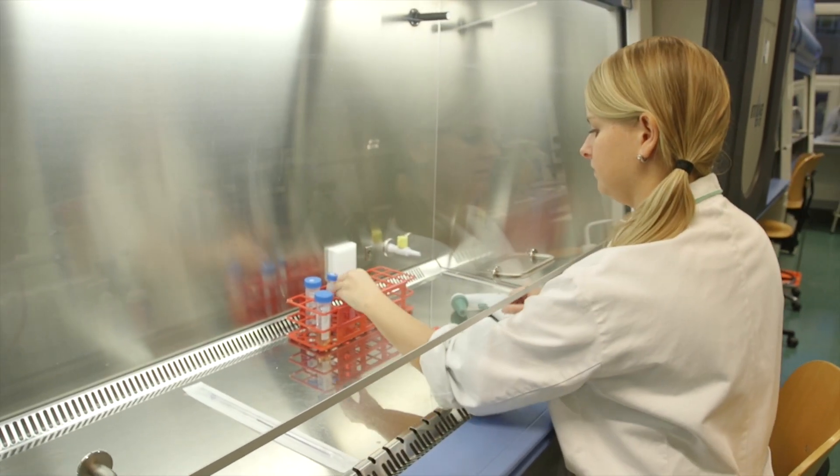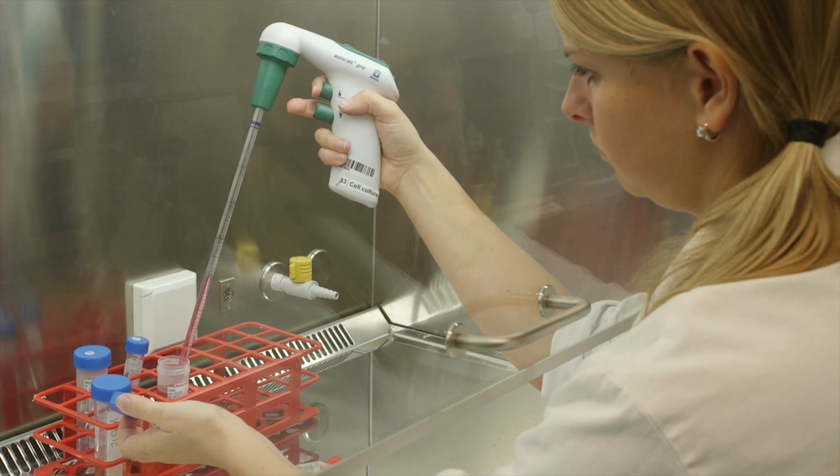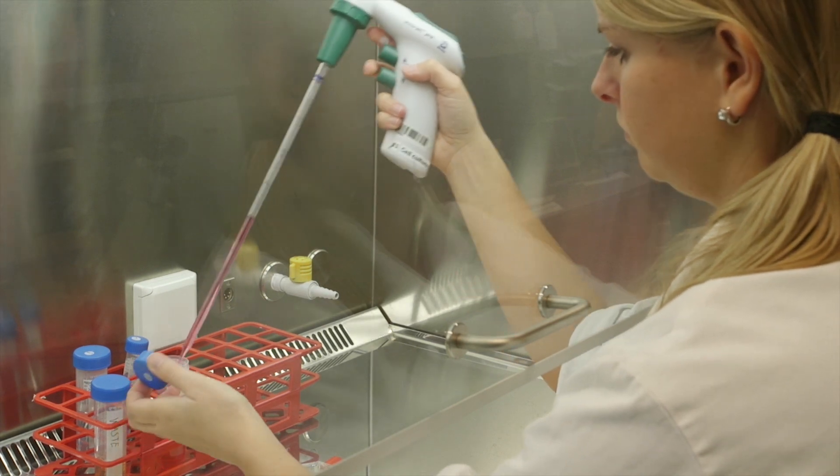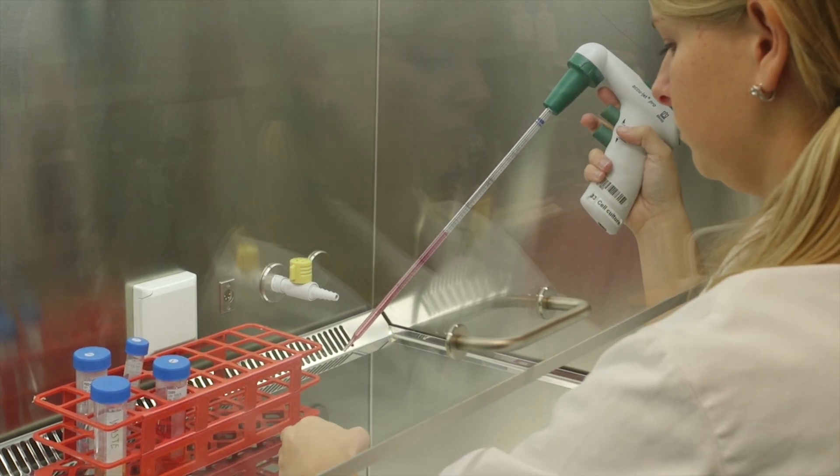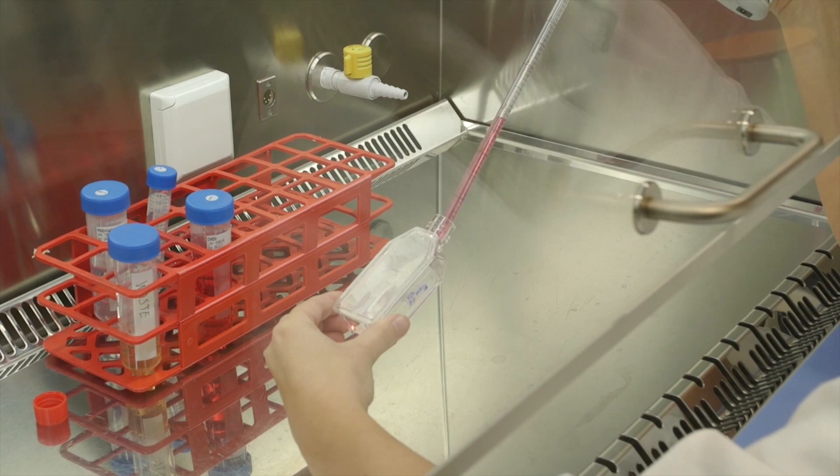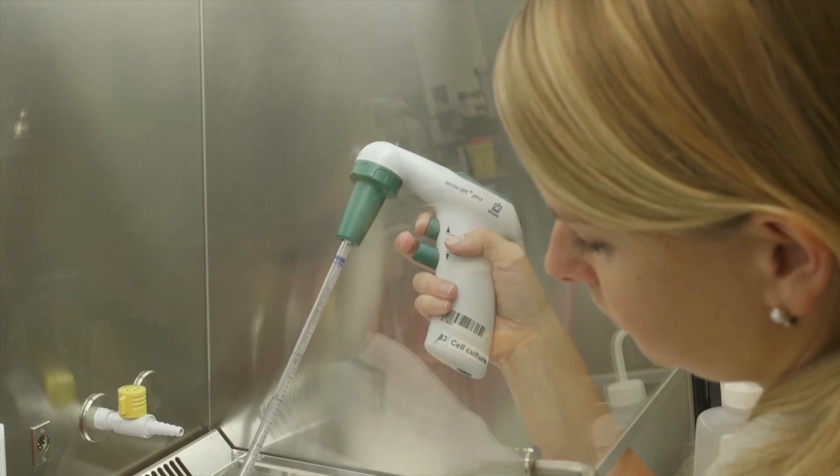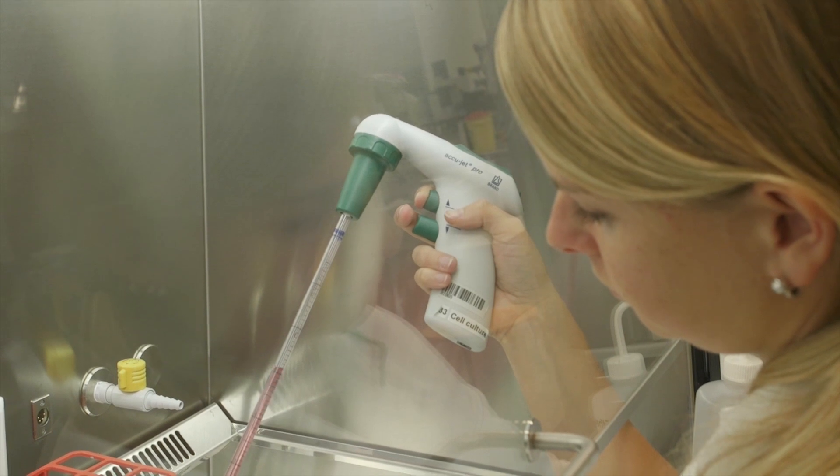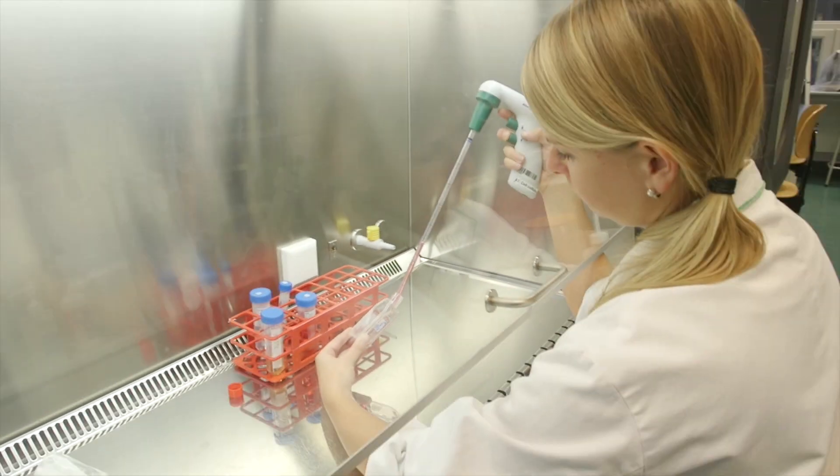When the cells are detached, the trypsin needs to be inactivated. If the cells are left in contact with active trypsin for too long, the cell membrane may be damaged. To do this, we add 4 ml of medium with FCS to the cell suspension. Because some cells may be slightly attached to the bottom, pipette the liquid over the bottom of the flask. This can be repeated several times by aspirating and then dispensing the suspension over the bottom.